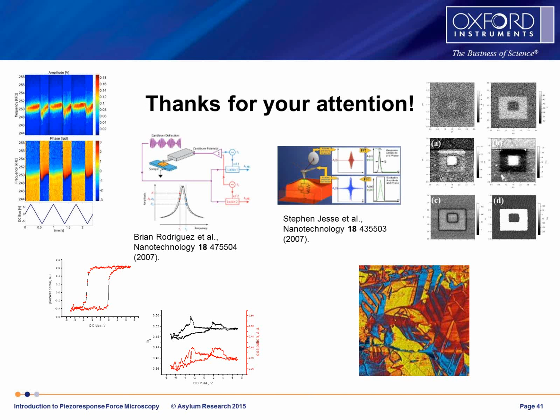However, it matters because all the size effects in the gap are magnified by the ratio of dielectric constant between the gap and the surface, and ferroelectrics tend to have a very high dielectric constant. So in this case, even a small gap can have a disproportionately large effect.